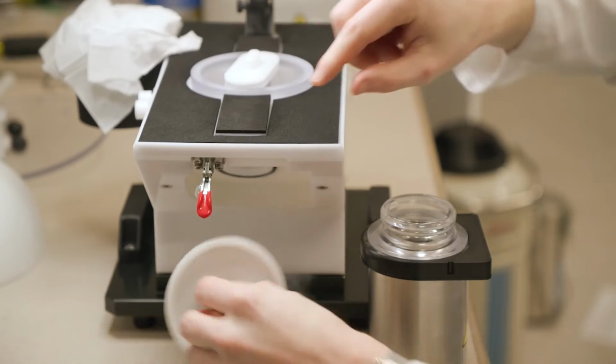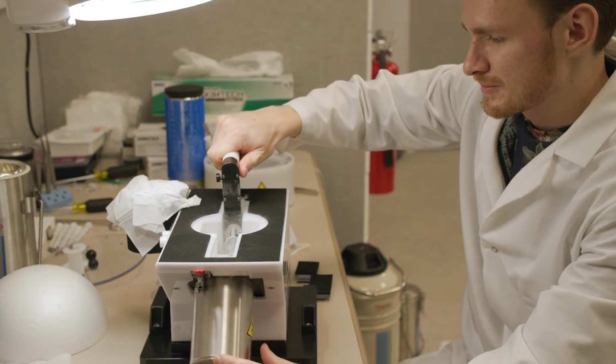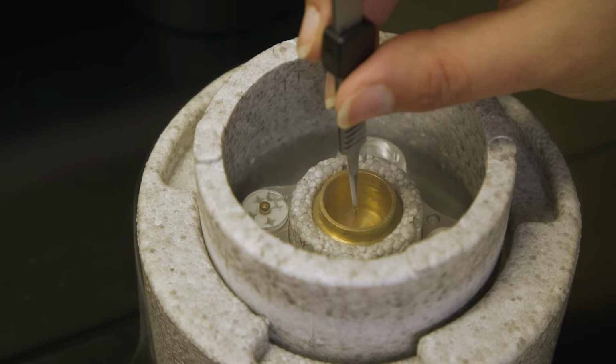The facility was built as a structural biology initiative, and they have a promise to give high access priority to young investigators to ensure they have enough microscope time to launch their own project and establish their lab. Allowing my students to be the ones to be trained on how to use the cryo-EM in the first place, and then also to be the ones who actually collected the data and went through all the troubleshooting steps to find the conditions that would work well for cryo-EM was very important. And that was what allowed us to push this project forward.